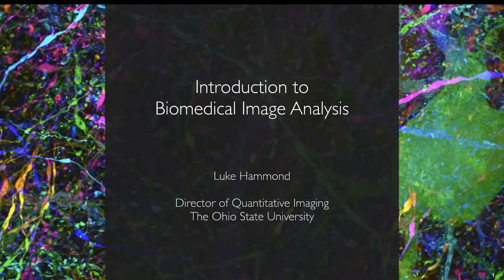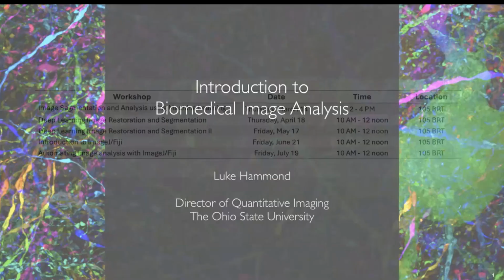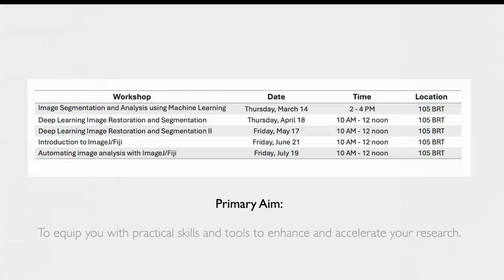The idea of these workshops is really to equip people with practical skills for image analysis. You don't necessarily have to attend every one, but we'll work through in this order. Normally we start with how to use ImageJ and then move onto more advanced things. But for many people I've met here at OSU, working with Ilastik and doing pixel classification is something that will immediately have great benefit to their work.